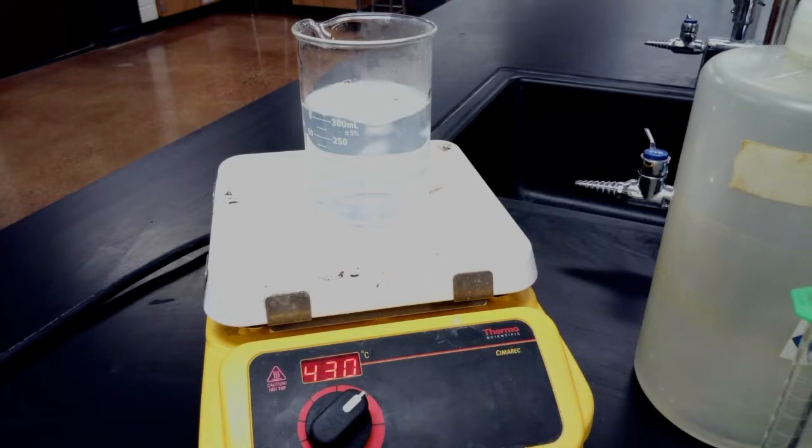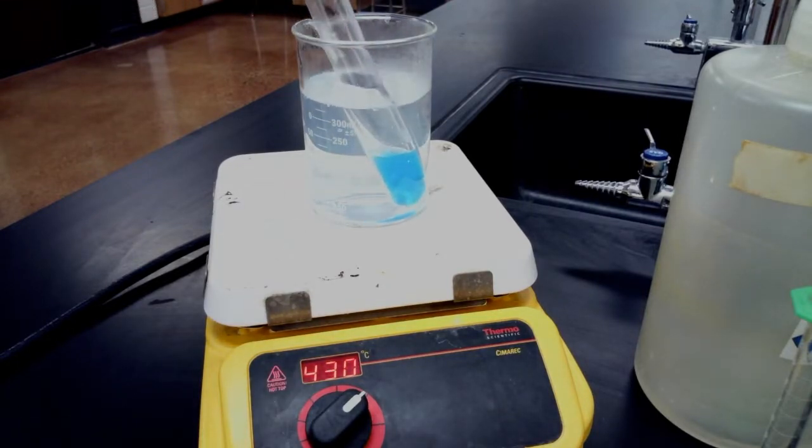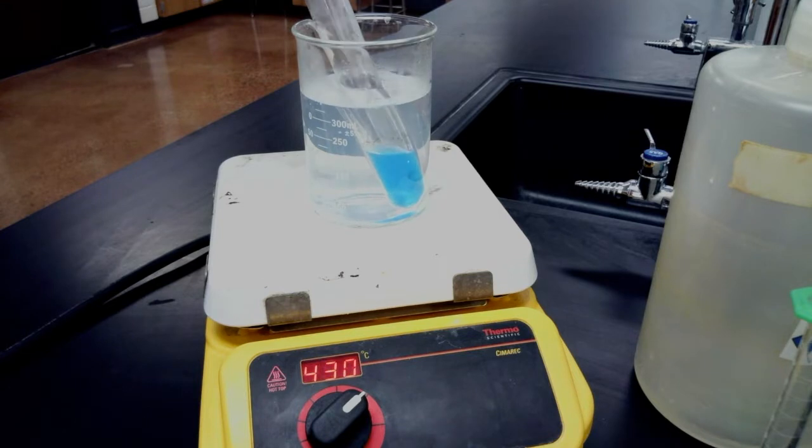Then the next step is to put the test tube into the hot water bath. It's really important as you heat this to make sure you stir it occasionally, because the bottom of the test tube gets really hot, and then all of a sudden the liquid at the bottom will boil and a bubble will form, and it can spray the contents of the test tube out. That is called bumping. I'm going to just let you watch and observe the change as this occurs.